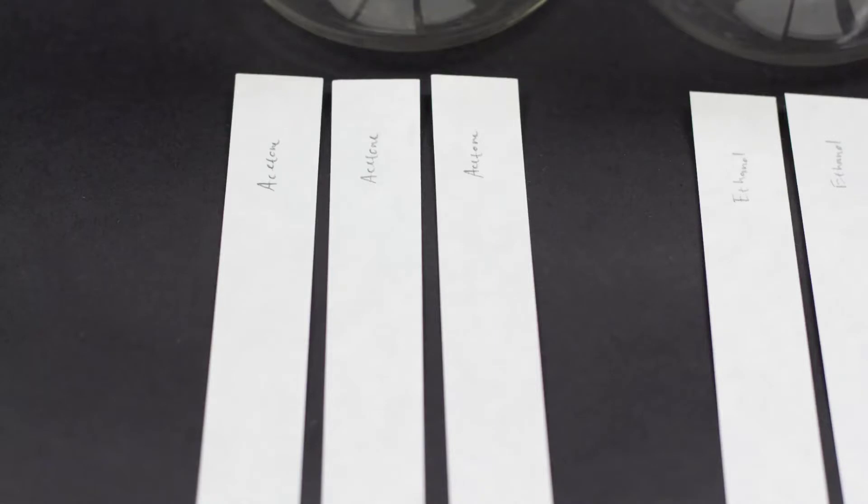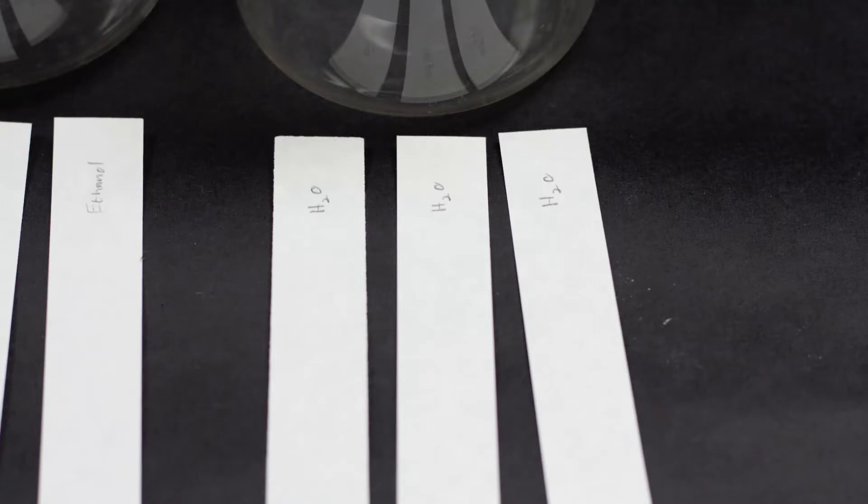Label three of the papers water, three of them acetone, and the other three ethanol. So we'll be using three papers for each solvent.